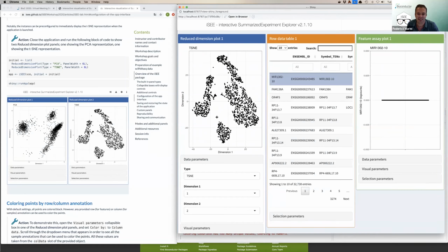Okay. Because it has to contact the server to draw the point. I'm going to try this time. As long as you click slowly enough and wrap up, you see that we just selected a number of points with a non-rectangular selection, which is pretty handy if you ask me, because otherwise it wouldn't be possible to capture this strange shape, which is not showing now. And now I'm patient, but let's see if it works now.